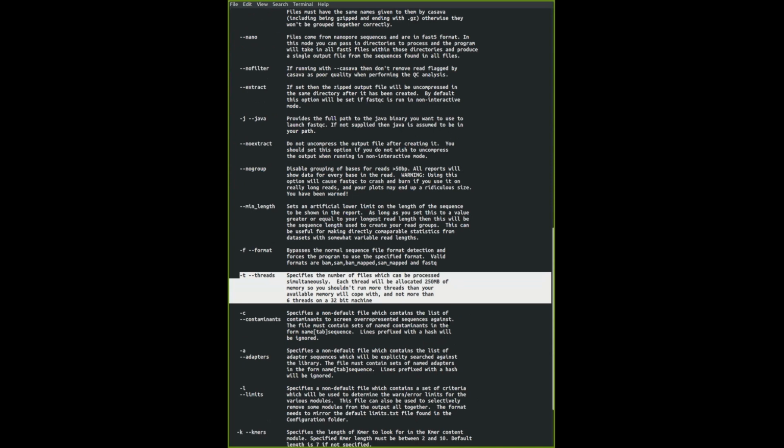If you have only one or two files, you don't really need multi-threading. Basically, you provide a couple more CPUs to this operation. If you're on a MacBook or MacBook Pro, you typically have 4 CPUs, which means the maximum number of threads is typically 8. You try not to use more than 7, and you leave 1 thread for your other operations.